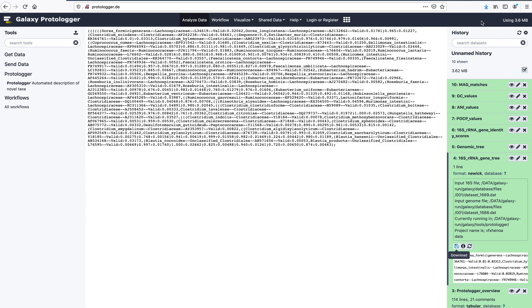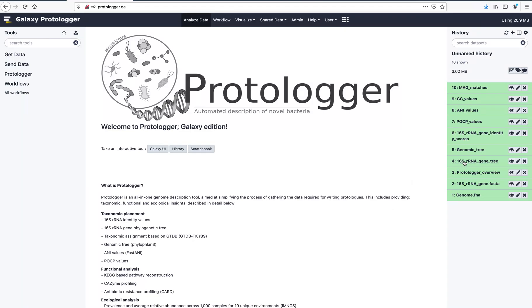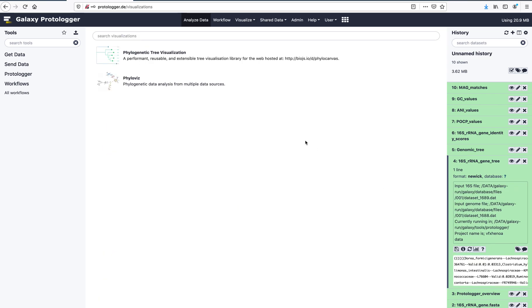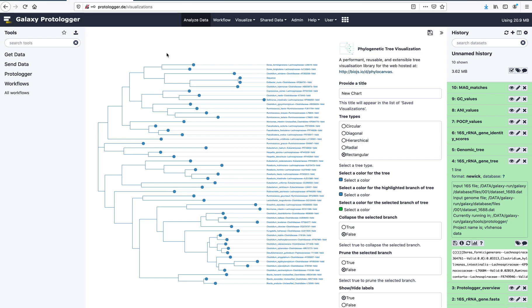For users who have created a personal account and are logged in, trees generated by Protologa can be visualized. After clicking on the file you wish to visualize, click on the graph symbol at the bottom and you will be taken to a list of tools available to view your tree. In this example, we will use the phylogenetic tree visualization tool.